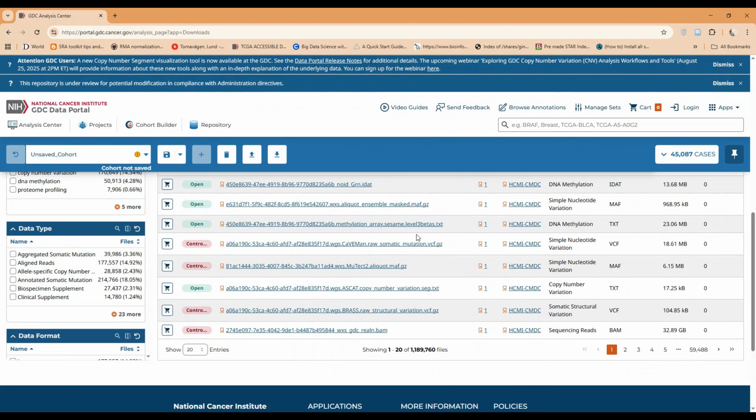And if you were not able to download the data, please write down what is the challenge you're facing and how I can help you with that. The best thing I would suggest is to download the data from NCBI or ENA through SRA toolkit, and that would be the easiest way. Those commands are not very complicated, but you can do it anyways.